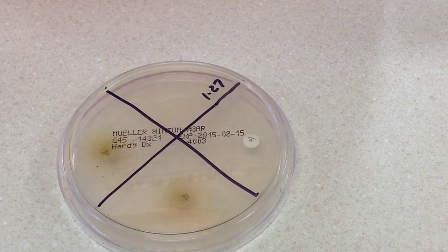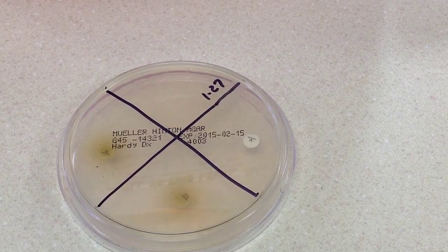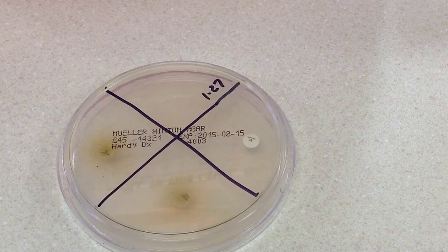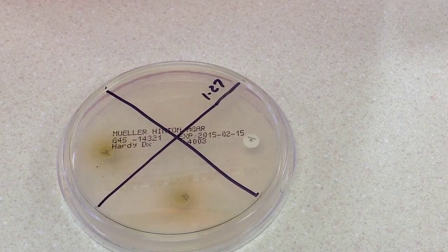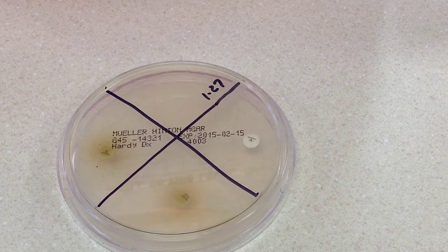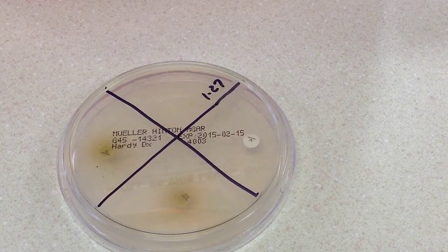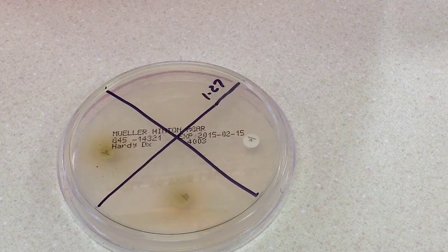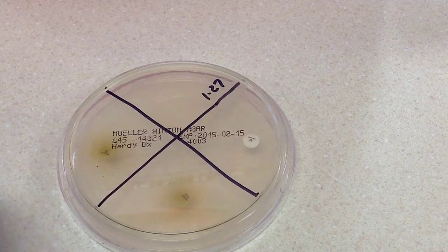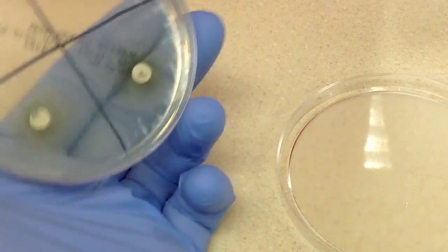Alright, so I'm reading this plate now at actually 72 hours. I checked it after 24 and 48. 24 there was almost no growth. 48 there was some growth, but for the purpose of recording this on video, I decided to wait until 72 hours just so there is something that you could actually see on the plate through the video camera. So what we're looking for in this test is growth.